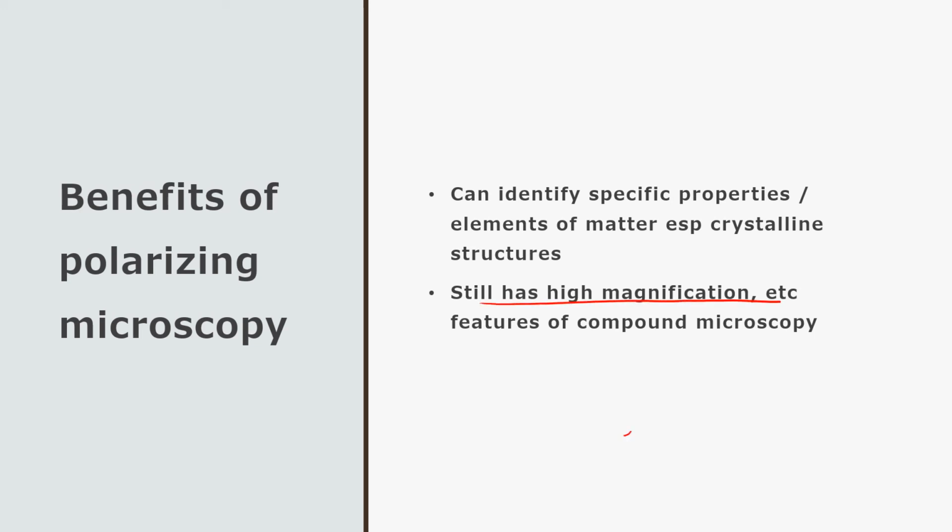Still has a high magnification. You have all the regular stuff involved with compound microscopy, all those basic benefits, because you can still see the thing overall at the other end of this in the eyepiece.